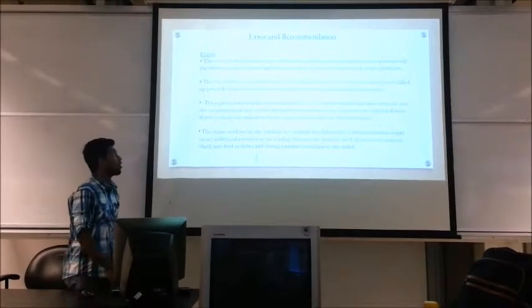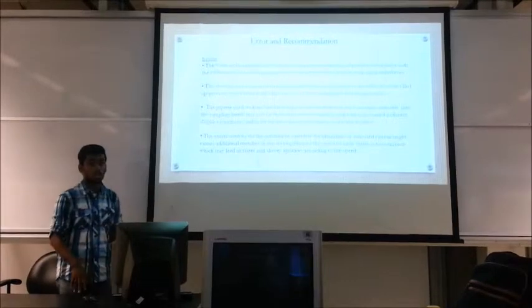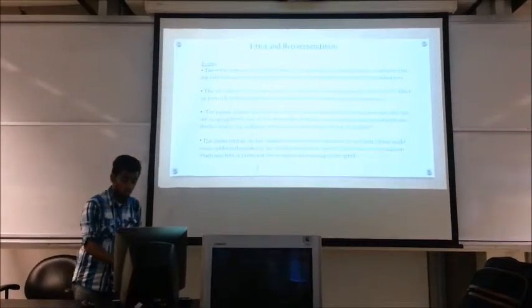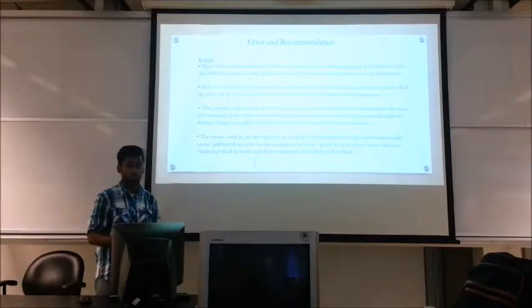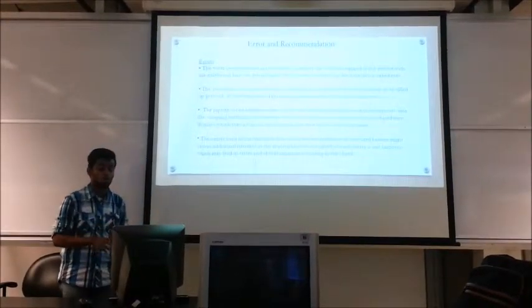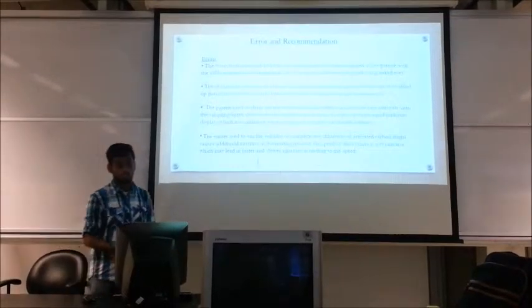The next point is that for this particular action, we are using another apparatus which is called a pipette. The pipette is used to drain out the solution from the beaker to another sampling bottle, and at each time interval, the sampling bottle needs to be thoroughly cleaned. But in this case, it is not clean because it might have some unwanted residue which may influence the preciseness and the exactness of the absorbance.